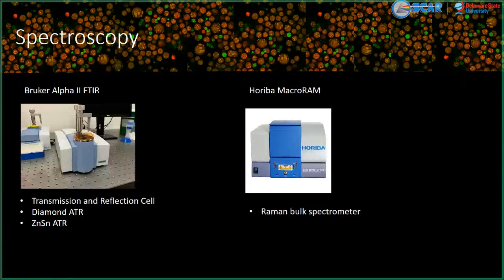If you're not familiar with Raman, it's a technique that's been around for a very long time, but it's getting a lot of publications lately due to the fact that we're understanding it better. Detection techniques have become much more sensitive, so we're able to detect the Raman spectra a lot better than we used to in the past, and that's becoming a very relevant technique because we can create very discrete signatures for different types of molecules, proteins, carbohydrates, DNA, almost anything you can think of. We can extract a very distinct Raman signature for that sample.